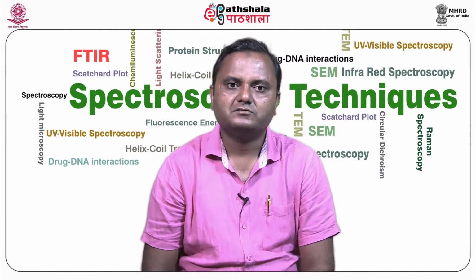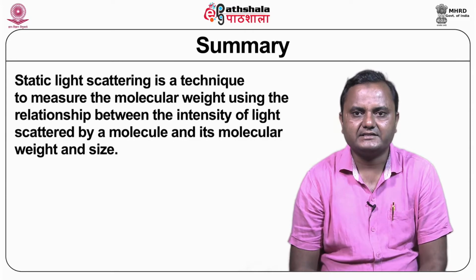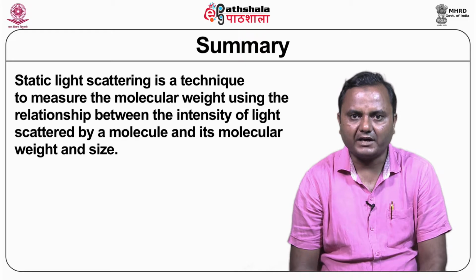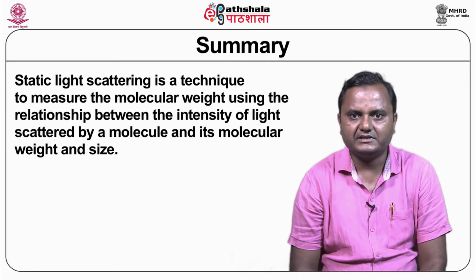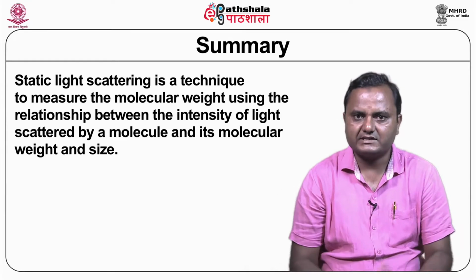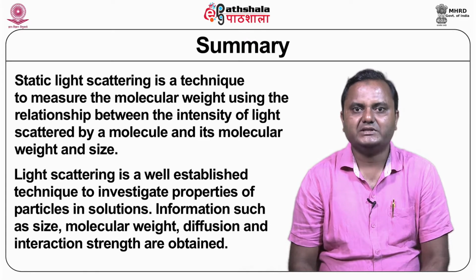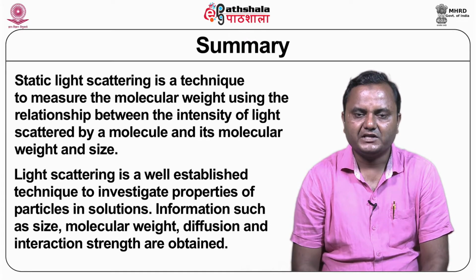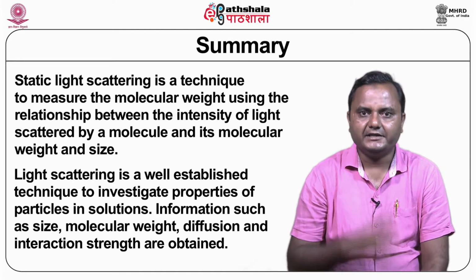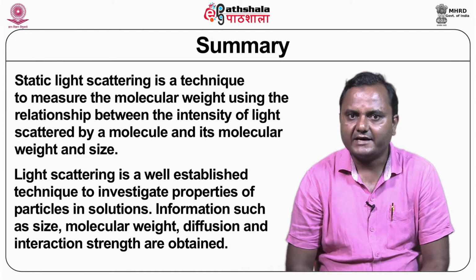So, guys, now we have to summarize this module. Light scattering is a technique which is used to measure the molecular weight of the particle using the relationship between the intensity of light scattered by the molecule and its molecular weight or size. Light scattering is a well established technique to investigate the properties of particles in solution. Information such as size, molecular weight, diffusion and interaction strength is obtained by using SLS.